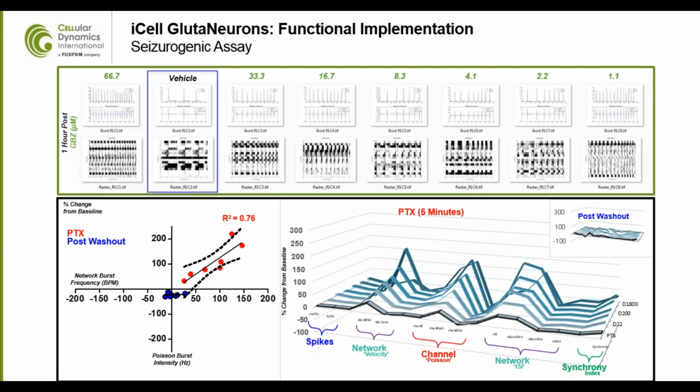What we'll see with Dr. Bader's presentation is really how you can look at those endpoints as a gestalt, or as the whole, and really do fingerprinting and classify your unknowns into distinct chemical classes and compound classes. So really taking this first level analysis to a higher order.